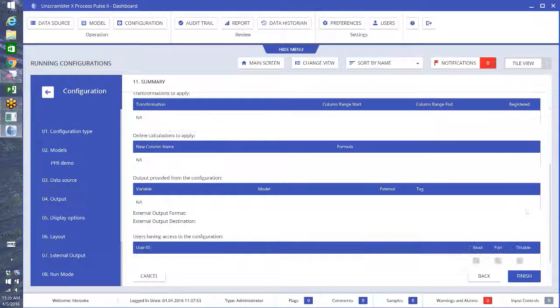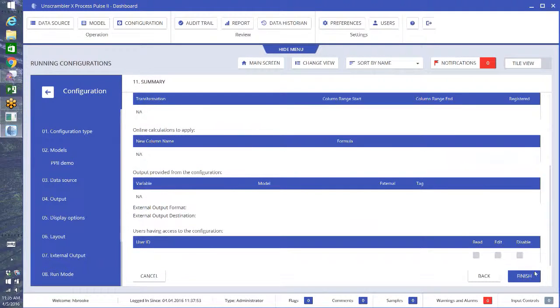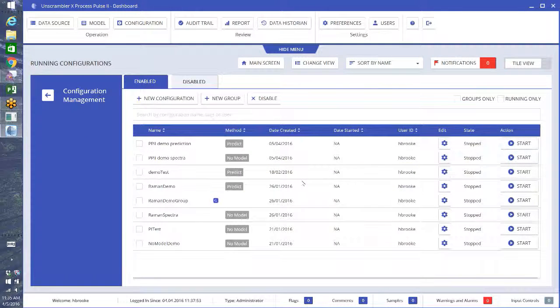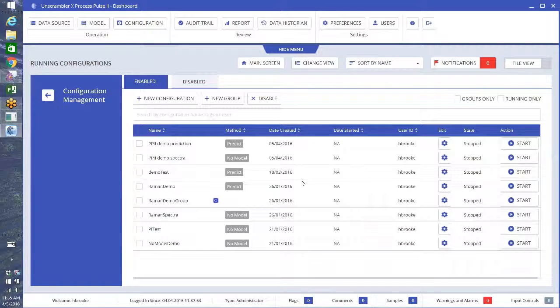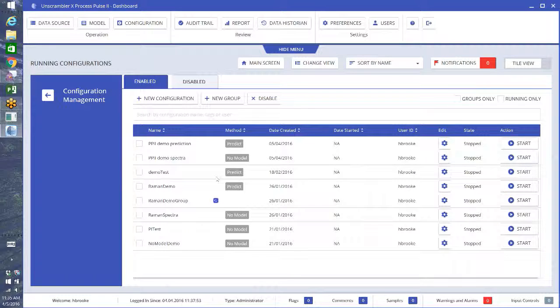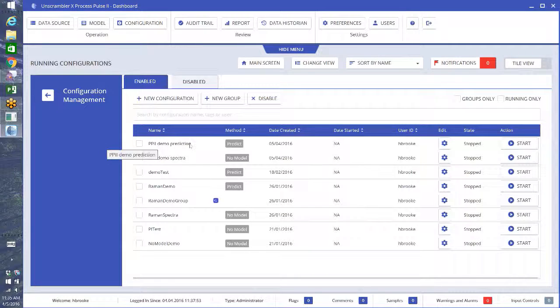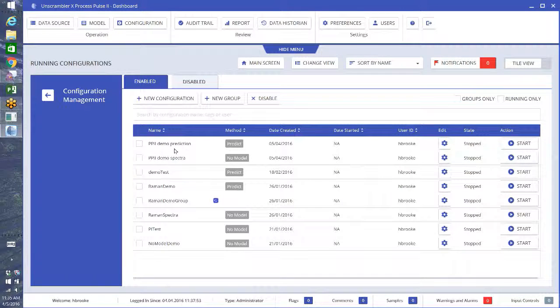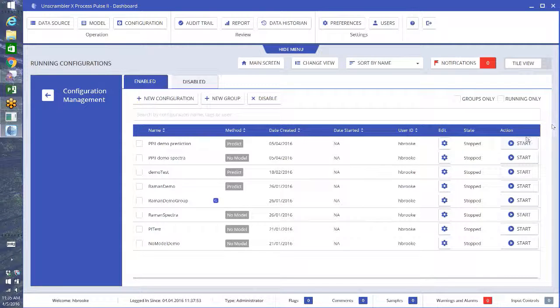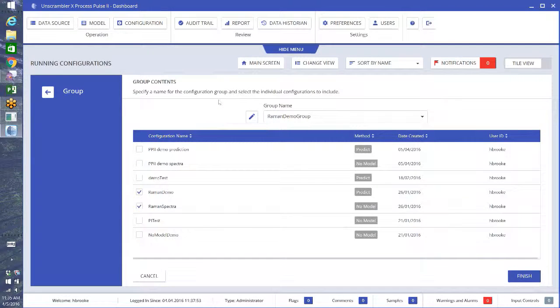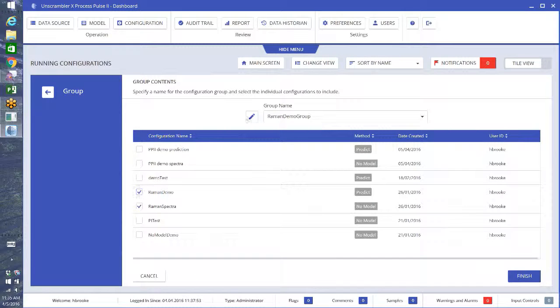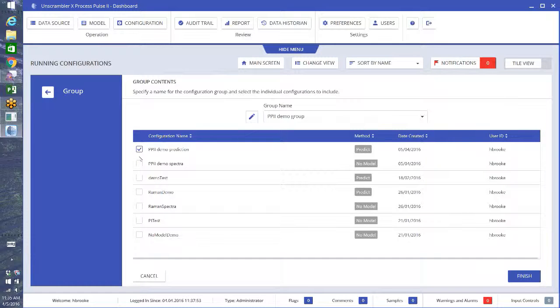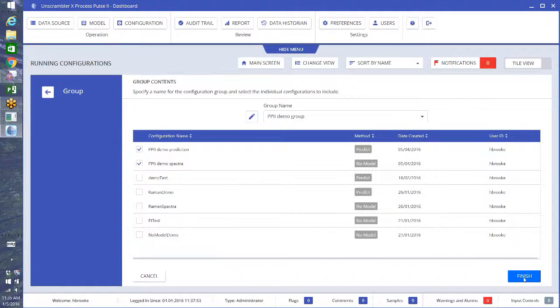Now one fun thing that we can do as well, once you have a number of models and configurations set up in here, you can actually make groups. So if I'm looking at these two that I made together, I'd like to run them at the same time, and instead of pressing start on each of them individually, I can make a group. So I can press this button, new group, and edit my name. This is going to be Process Pulse 2 Demo Group, yes, and I'm going to choose these two Process Pulse 2 Demos and finish.